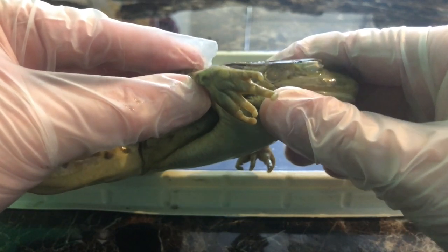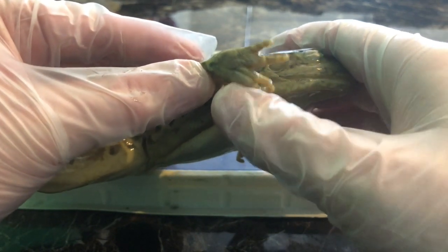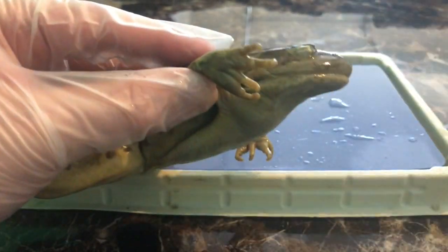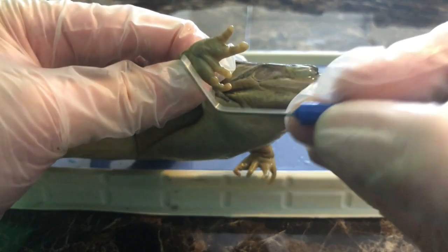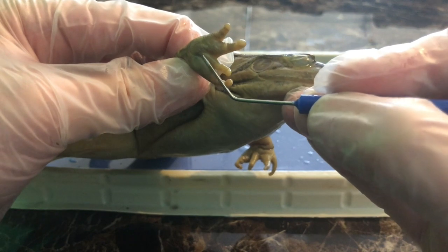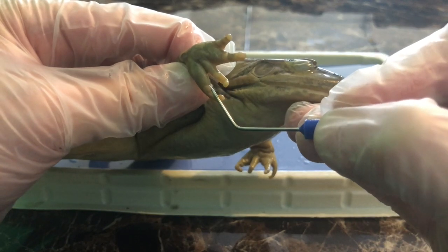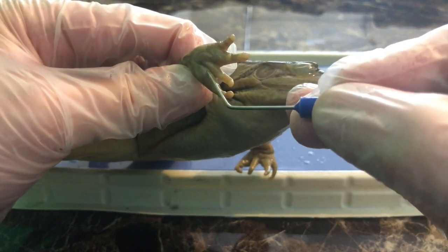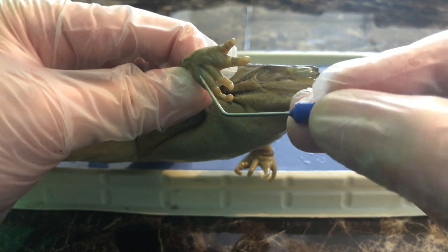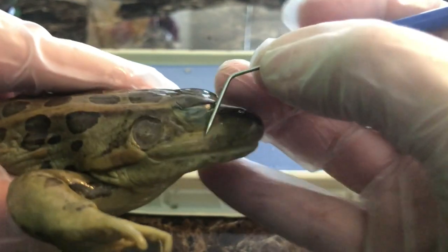Now to identify if this is a male or female, we're going to look at the thumb pad. Right above my thumb you can see it has a very large thumb pad. So this is a male — a female will not have this large thumb pad. Only males have it. You can see four fingers, four digits, and the large thumb pad, confirming this is a male.